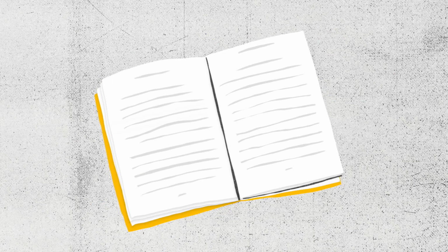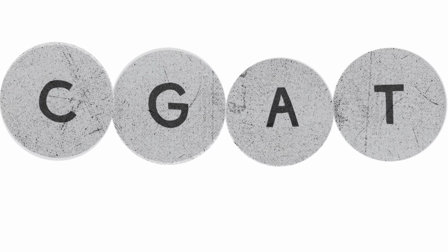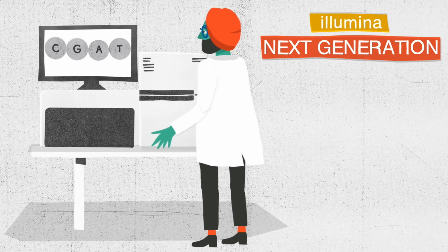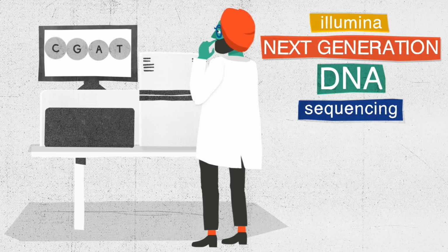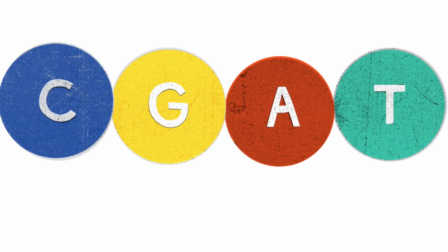If we think of DNA like two strings of pearls coiled around each other, each pearl is one of 4 bases. At the University of Oxford, geneticists use a technology called Illumina Next Generation DNA Sequencing to identify the order in which the bases are encoded within a strand of DNA. It assigns a unique fluorescent label to each of the bases, which makes them easy to recognize.